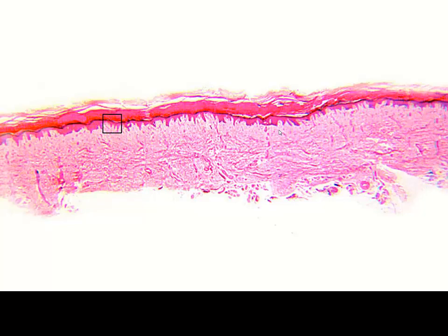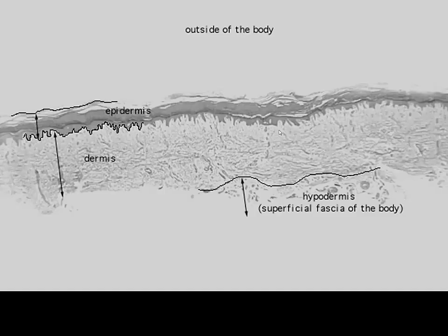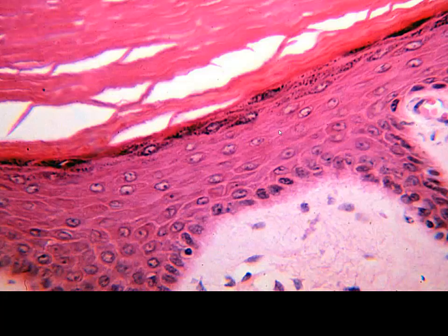Again, different stain, different view of skin. I think we can already classify that epithelium as stratified squamous, keratinized, even at that low magnification. Now we're going to look at the layering that we can see.